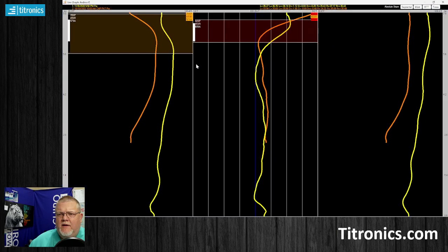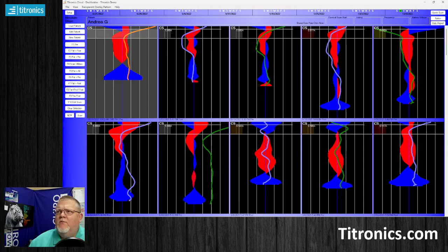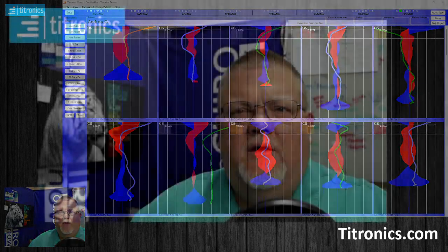Now I can overlay the one I had before, and it gives me my Pearson coefficient, it gives me my relative and my active. So anyway, that is one way. That is the way we've come up with to help you do what you do at a higher level.